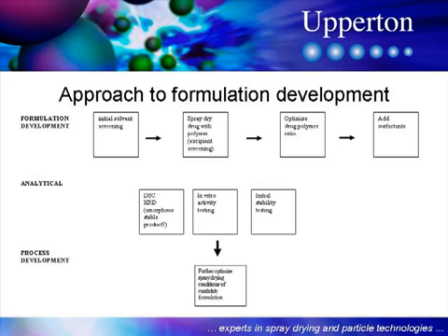We also look at the in vitro properties of the spray dry dispersions, looking at in vitro dissolution under a range of different conditions to ensure that the spray dry dispersion has good dissolution properties. We'll also put a number of our test formulations onto a small stability trial to ensure that the spray dry dispersion is stable under normal storage conditions.